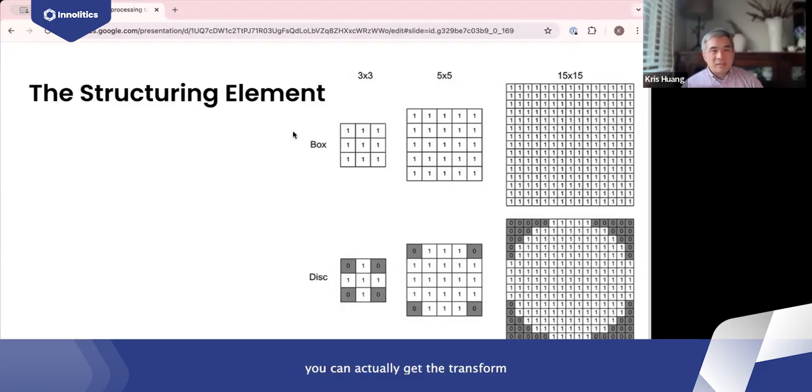If you know the transform that maps brightnesses from A to B, you can reverse it and get back to A without any loss really. So you're not actually losing information, but you are presenting it in a different way. I don't know if that answered your question, but that's a really interesting area.